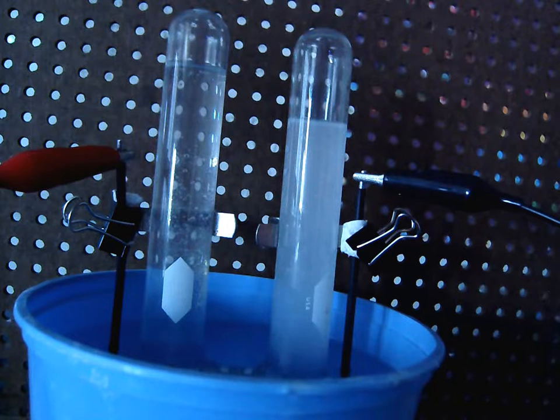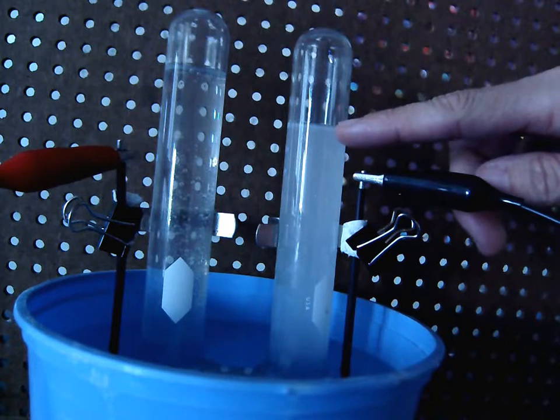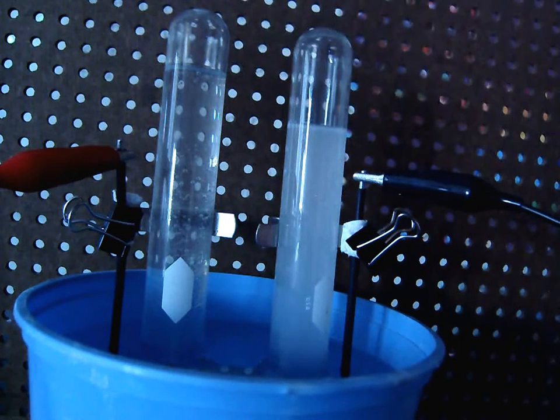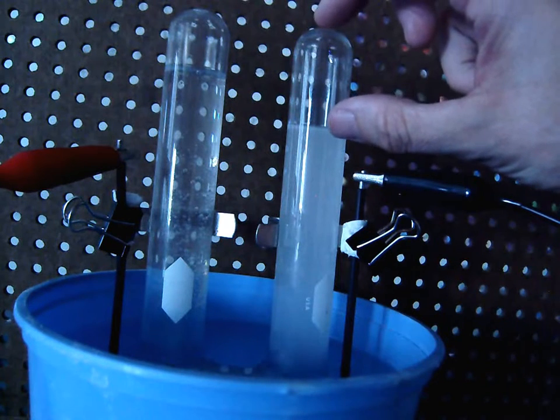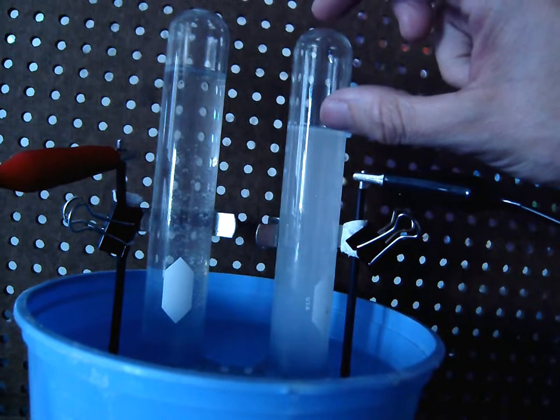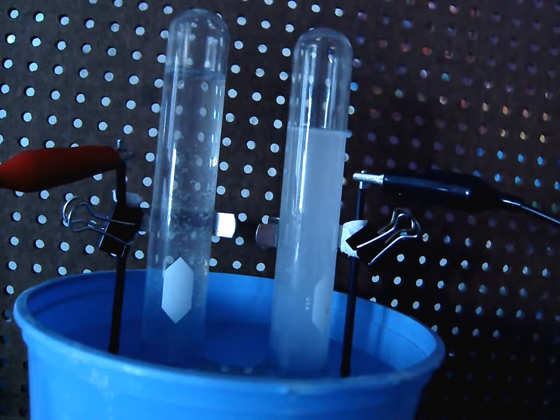Okay, so here's what we would do next. We would actually probably let this run a little bit longer, but for the sake of where we're at, I'm going to push the little off button here. No, I'll let it keep going. Here's what we would do. So normally I would hit the off button, and we would measure how much gas is produced. We'd mark the level here, and we mark this level here, and we could pull the test tubes out, and we could fill this much space with water, and then measure how much space that is, and say that's how much gas was produced. That way, when we measure it, we'd be measuring the volume.